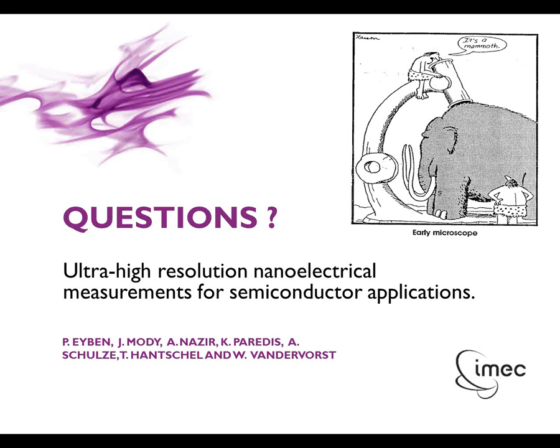Yeah, Thomas, although I did not do the measurements Pierre presented, I can comment on this. Once we move to organic material, often the material is quite a bit softer. So if we still stick to the same mode, contact mode, and forces that we use on the semiconductor, we will definitely be rubbing things apart.